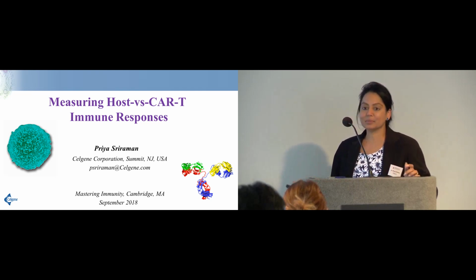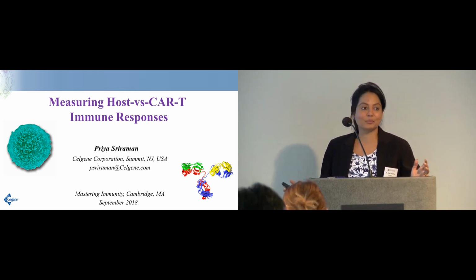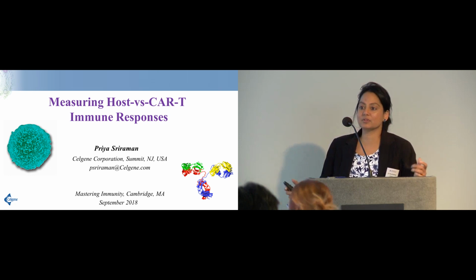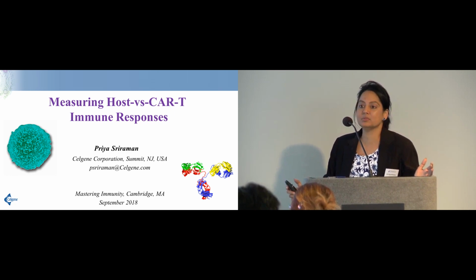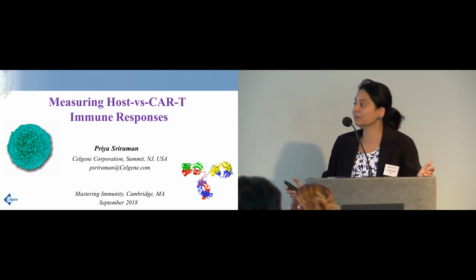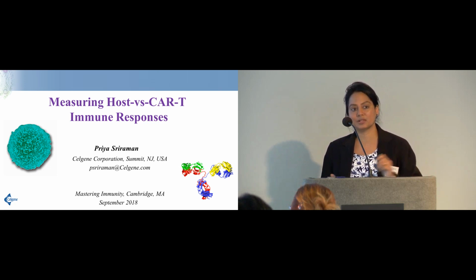I changed my title because I saw I was going after Emily, and I figured I might as well get a little broader than just the ELISpot assay qualification. So my group is responsible for characterizing immune responses to all of Celgene's biologics and CAR T therapies, as part of our mandate. We were charged with measuring host versus CAR T immune responses, and CAR T was new to me and to Celgene at that time. The work that I'm showing you is what happened over the last 1.5 years to characterize this.